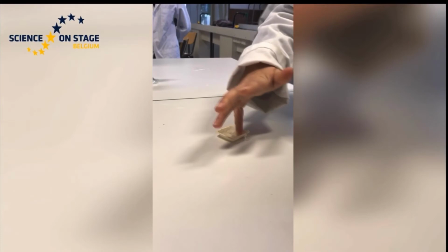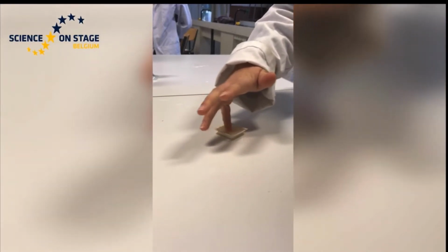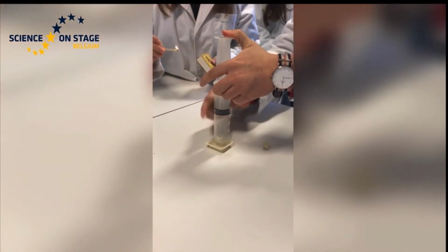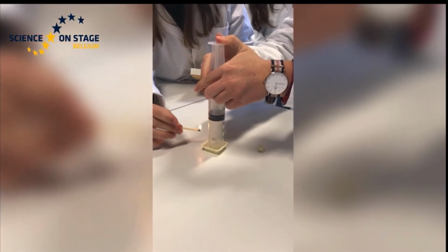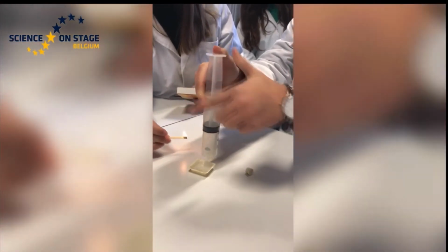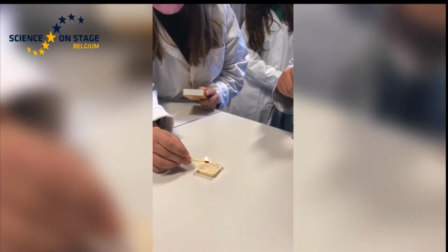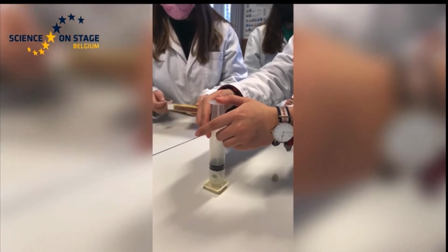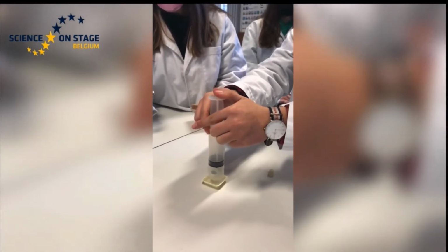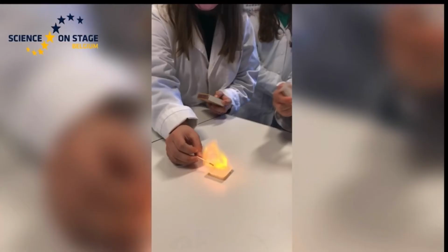To observe the combustion of this gas, we prepare soapy water, a little bit of water and a drop of washing up liquid, and we make bubbles in the soapy water with the syringe. We prepare the match to set fire to the soap bubble containing the hydrogen, and we see that it forms a fireball bigger than the bubble. The hydrogen goes to look for its oxidizer, the oxygen of the air. There is no noise. It's not an explosive combustion.